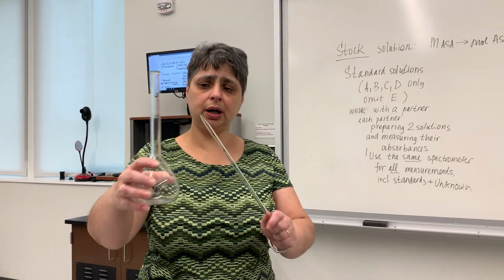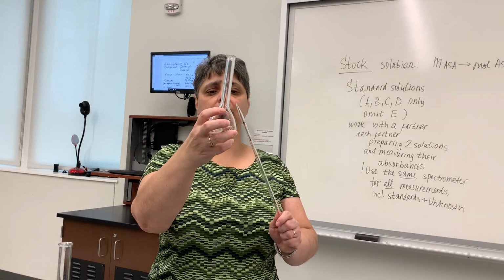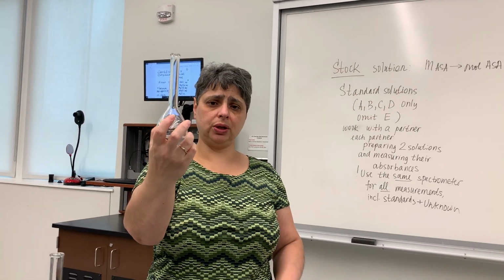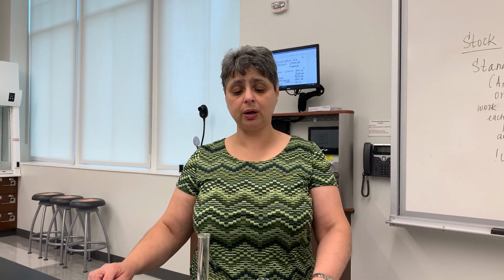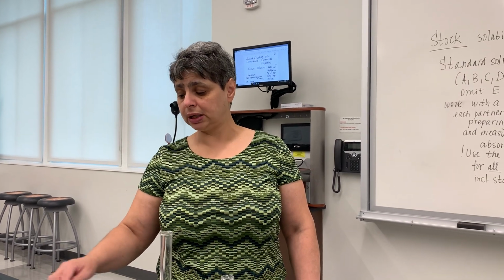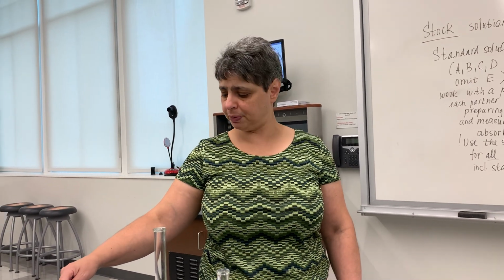First with water into the larger flask, and then with yellow solution into this flask, and measure the absorbance of this solution. And then this is going to be your unknown. So if you look in data sheet 2, where it says absorbance of solution, that's the solution that's purple in a smaller flask prepared from the tablet. You may skip percent transmittance. For both data sheet 1 and 2, there is an entry for percent transmittance. We are not measuring percent transmittance, so you can skip it.